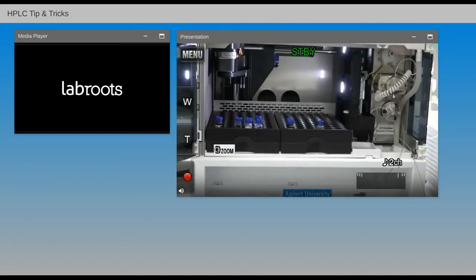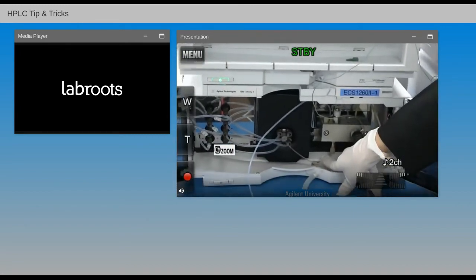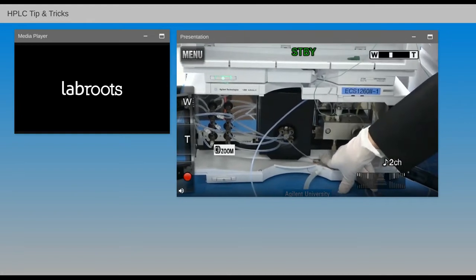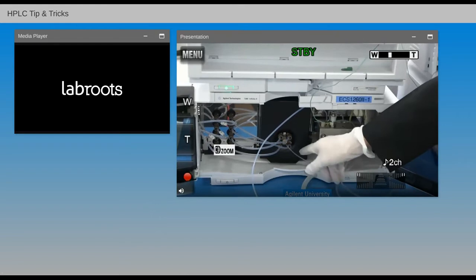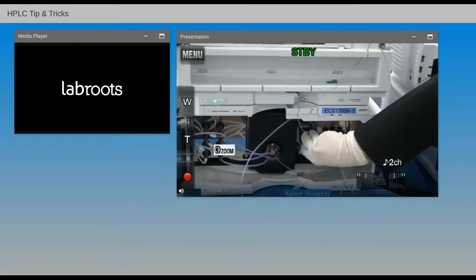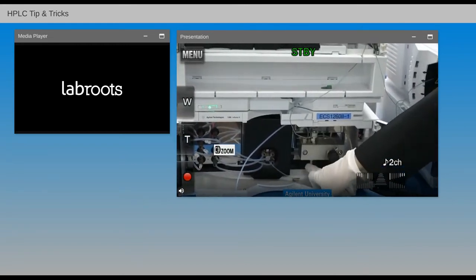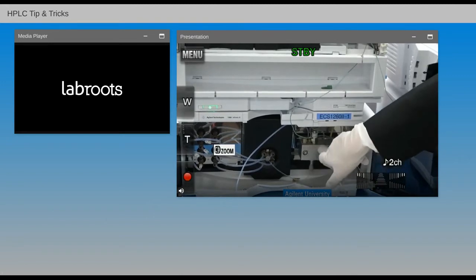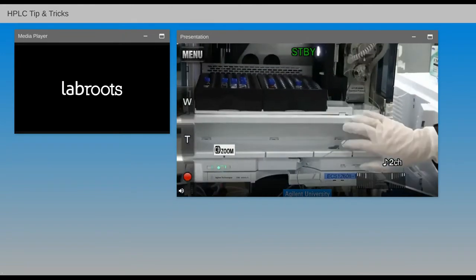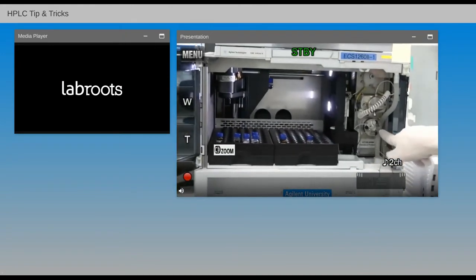As long as the mixing has already happened, when you are not running the equipment after your sample analysis, and yet you did not flush your instrument, they will start to have salt along the line here, or even inside the pump head, including the pump seal, or even inside all these valves that are connected to the pump head, and also to the capillary tubing.